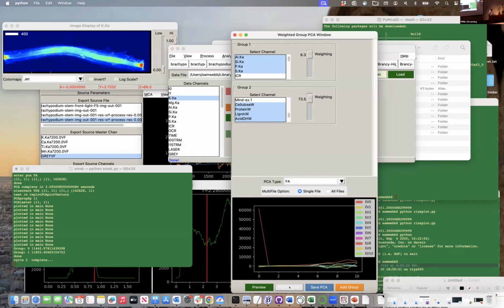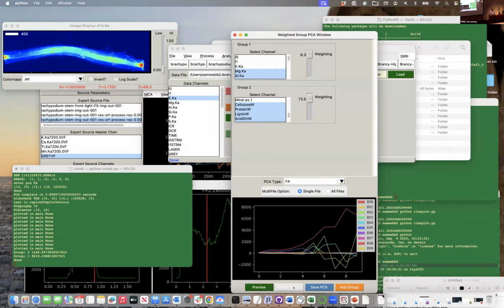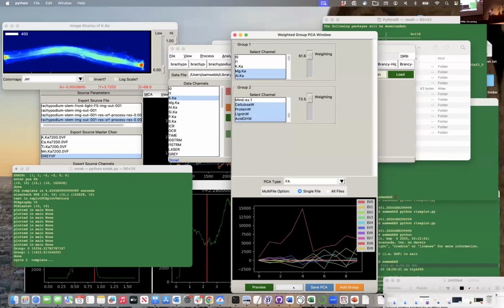other data. Now, because the potassium is so incredibly strong, I could repeat that and remove the potassium and say, potassium's there, I don't care about it so much in my analysis. And now I could do that balance and see that all those channels balance out with all my other infrared data, because you don't have one XRF channel that biases the data so much. And again, that applies with any set of fused data, whether it be mass spec, Raman, or infrared.